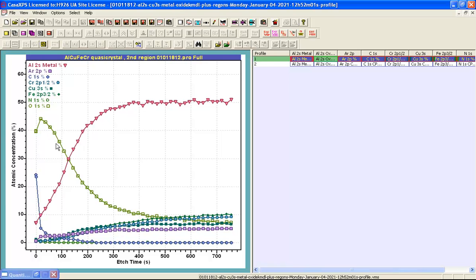But the traces that are left are still using the same symbols and the same colors as was used before the removal of this VAMAS block corresponding to the aluminium oxide.